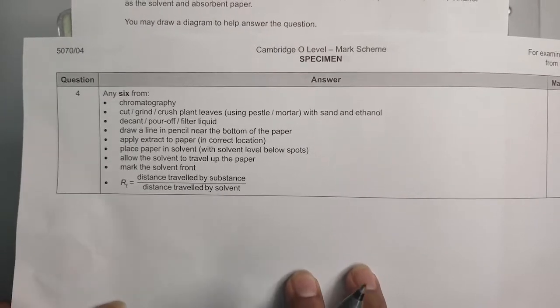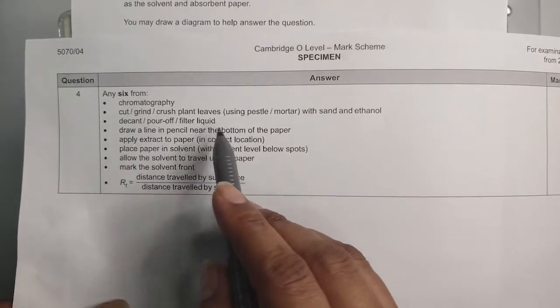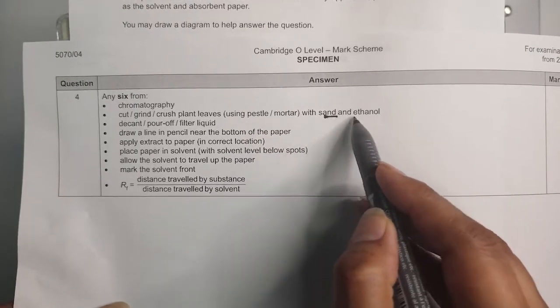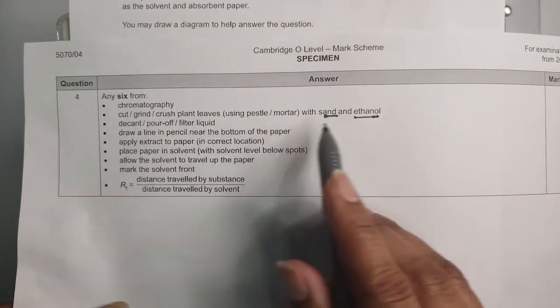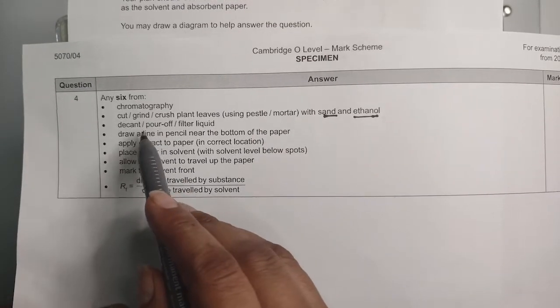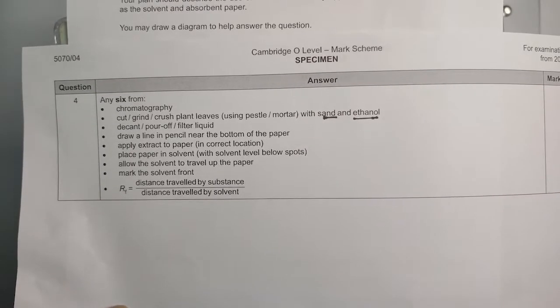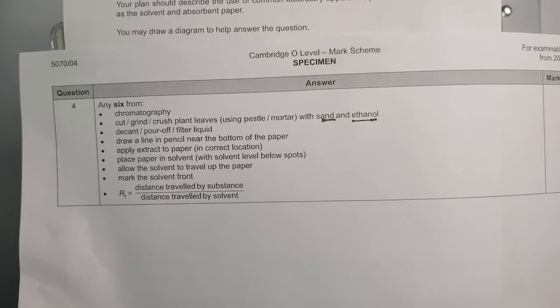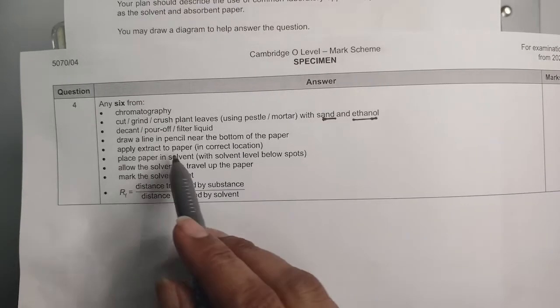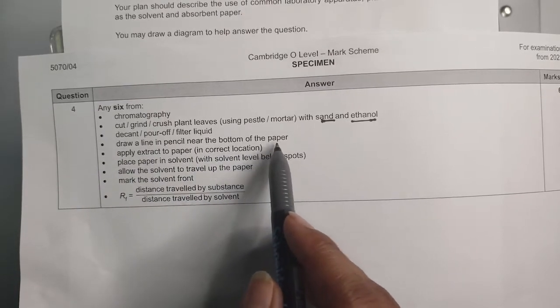First we will write: this is the chromatography technique. We will cut, grind or crush the plant leaves. After crushing the plant leaves, we will mix them with sand and ethanol. Then we will decant. Decant means we will pour off the liquid, like when you wash rice, the rice is left behind and the water is poured off. So we will pour off the liquid, then draw a line with a pencil near the bottom of the paper.